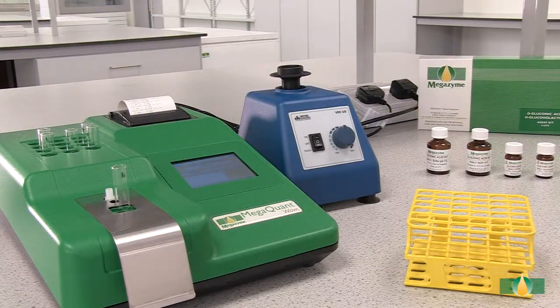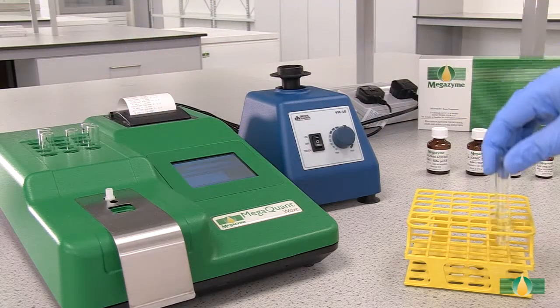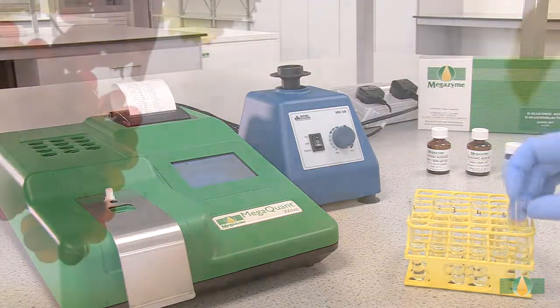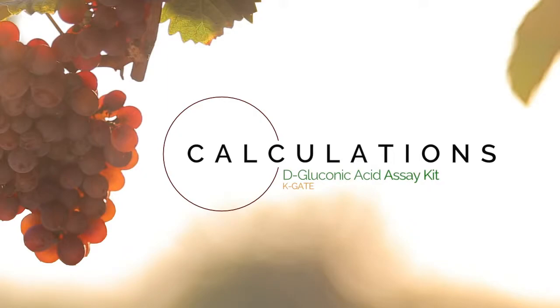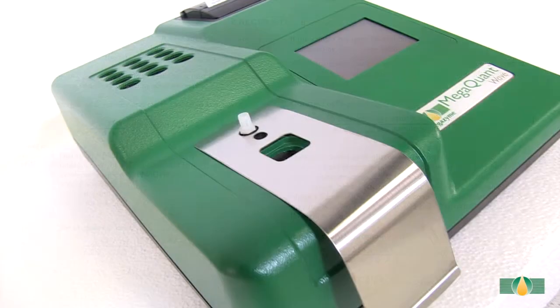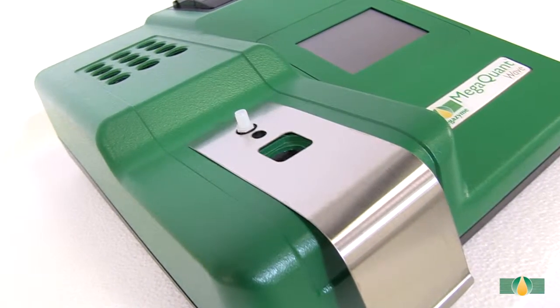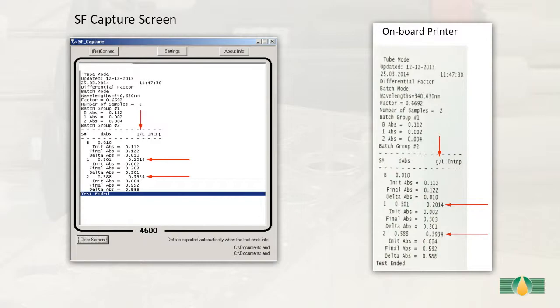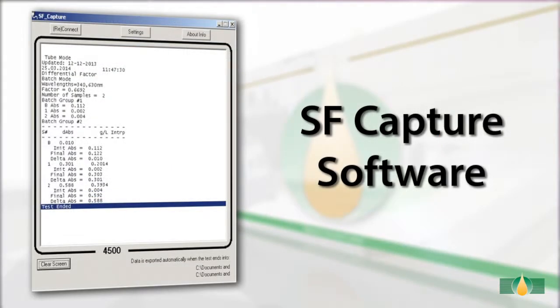Record the absorbance reading A2 for all of the assay tubes. This absorbance reading completes the measurement of D-gluconic acid. The absorbance readings A1 and A2 of the sample and the blank reactions are used to calculate the D-gluconic acid concentrations in the original samples. When performing this test using the pre-installed protocol on the MegaQuant Wave spectrophotometer, the results will be automatically calculated and printed via the on-board printer, or the data can be exported to a computer using the SF Capture software.